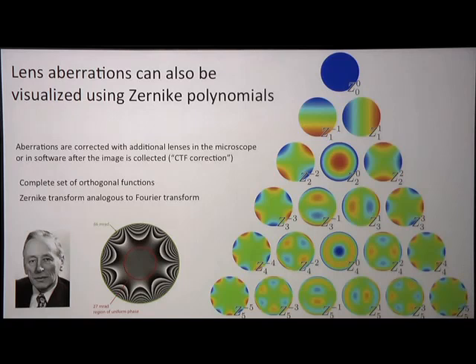And we can actually measure these. This is a measurement I did a while ago of the aberrations in a lens. But ultimately, our goal is to create a beam that has a nice uniform region of phase in the middle, and that's the bit that we want to actually image our sample with, because we want our sample to be shifting the phase of the wave, not our optics or some other thing.